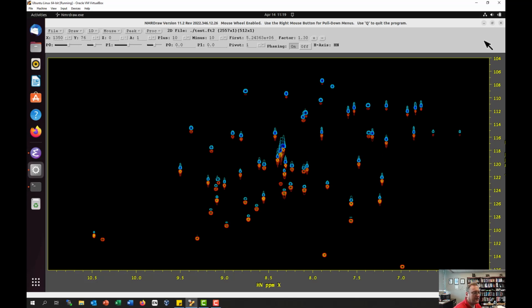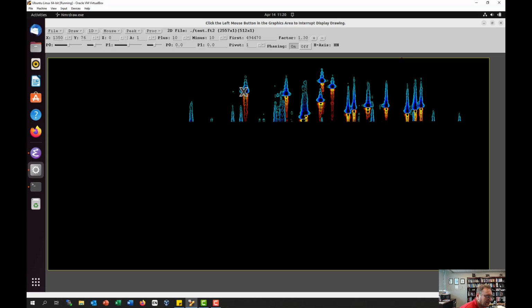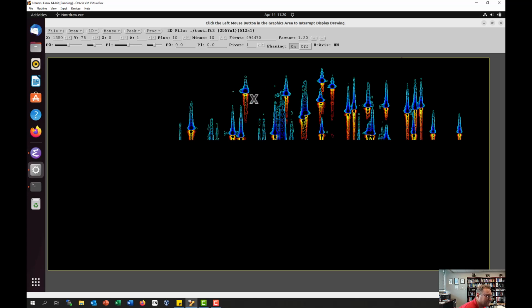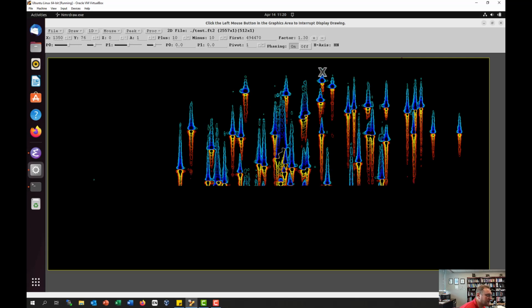And the other thing that you need to worry about is if we go here. Now again, it's the wrong value for this spectrum, but notice that you get these weird streaks. Right? So this is not just being in phase. Like down here, I'm getting these massive streaks in the positive and negative dimension, whereas here, the streaks are much less.